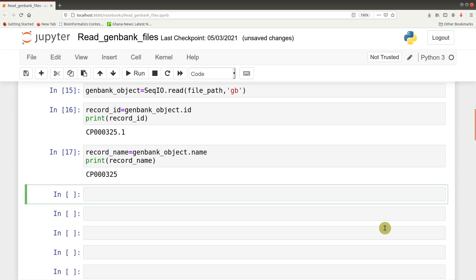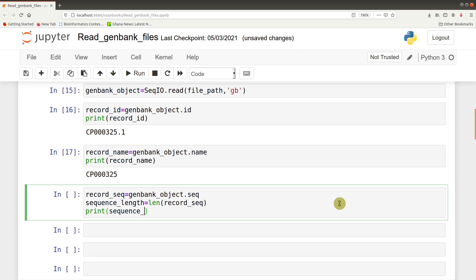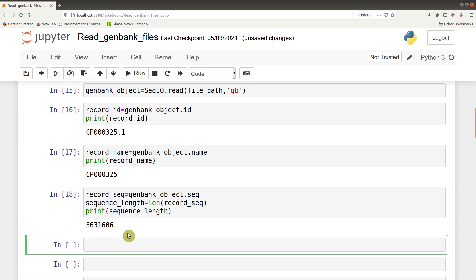Because it's a whole genome, you can also query the sequence: record_seq = genbank_object.seq. We can even find the length of the sequence: sequence_length = len(genbank_object.seq), then print(sequence_length). This gives us the length — it's 5.6 MB, which is the length of the whole genome sequence.